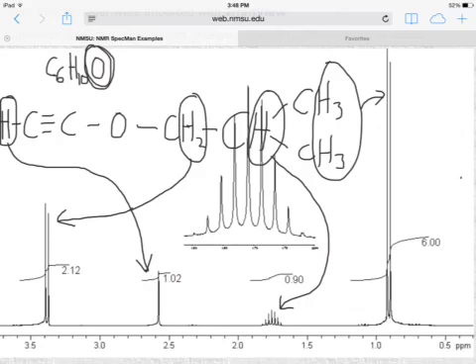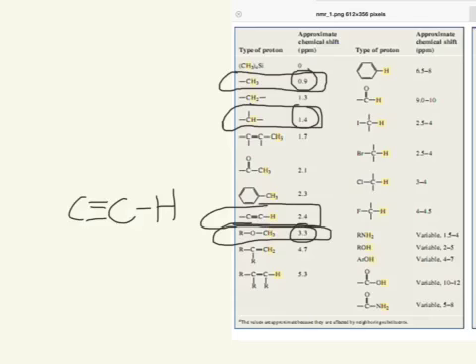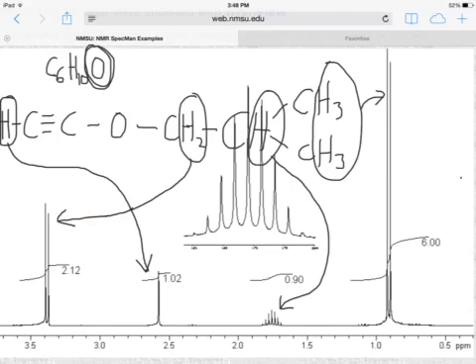Remember when we were looking at the expected shift of the methine group and we expected 1.4 and it's actually pulled to about 1.7 or 1.8? Well, now we can explain that since we see this molecule. The methine group here is close to this oxygen. So this oxygen is pulling electrons from the methine region through the inductive effect. And that is pulling the methine signal slightly more downfield than we'd expect to normally see it.